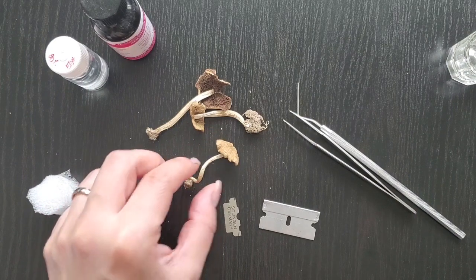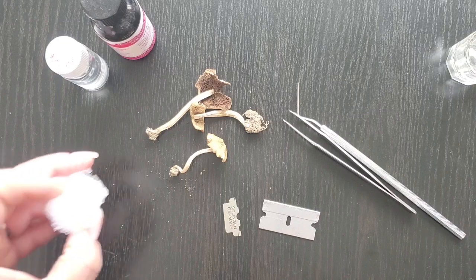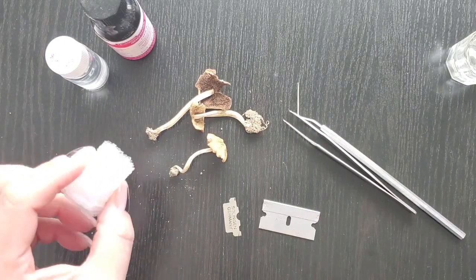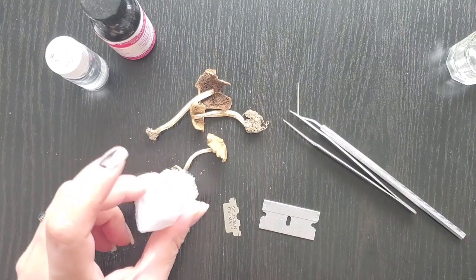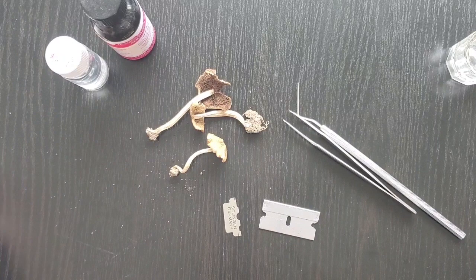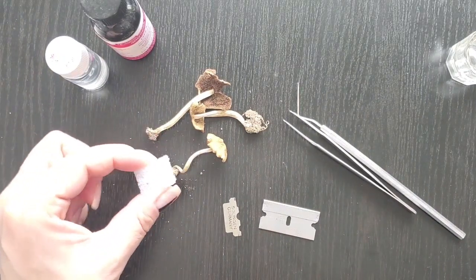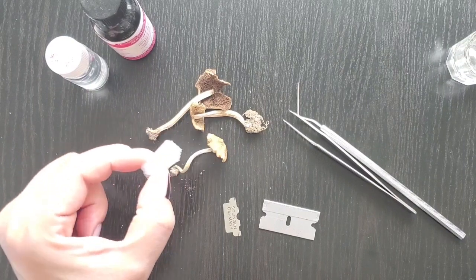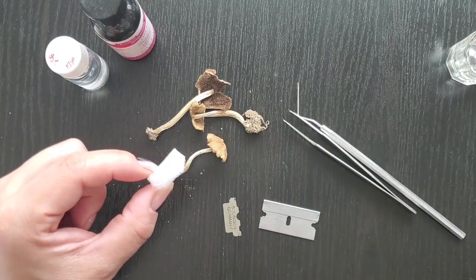The different things that I will be using throughout the video, for the first method, is Styrofoam. If you have Styrofoam peanuts, that's the best. I don't have any, so I just found something similar enough and kind of retrofitted and made a smaller square of what I'm going to use. So I'm going to end up using pieces like this. If you have an S Styrofoam peanut, you also want to make it into a rectangle. You won't use it in the S shape.